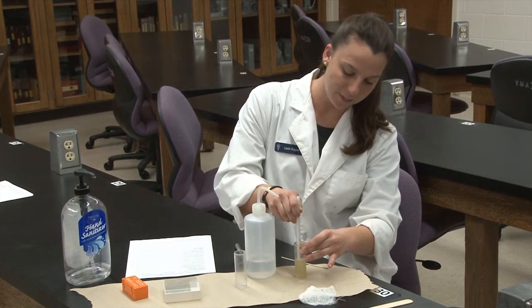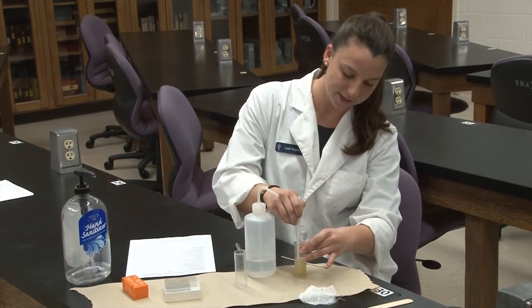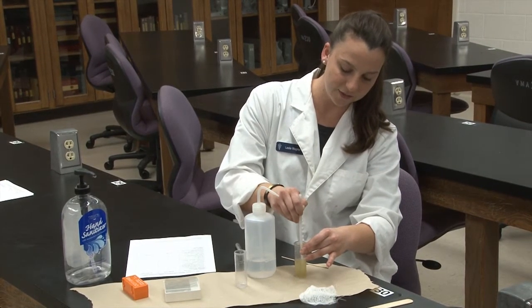Stir your sample up and make sure to break up any of the clods, so that it's very evenly distributed.